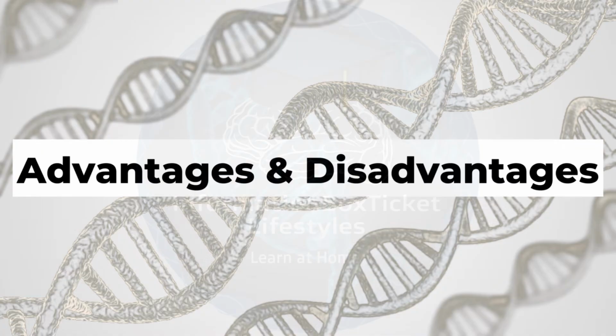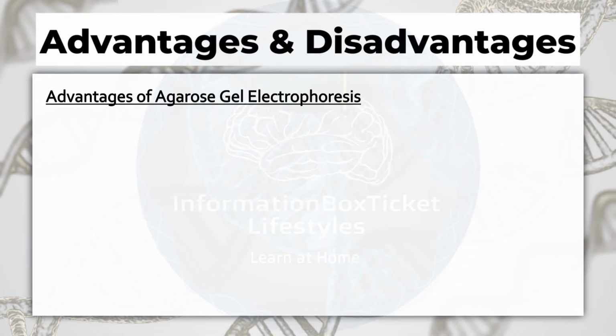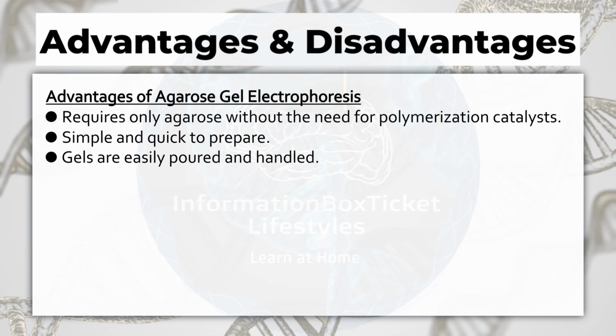Advantages and disadvantages. Advantages of agarose gel electrophoresis. Requires only agarose without the need for polymerization catalysts. Simple and quick to prepare. Gels are easily poured and handled.